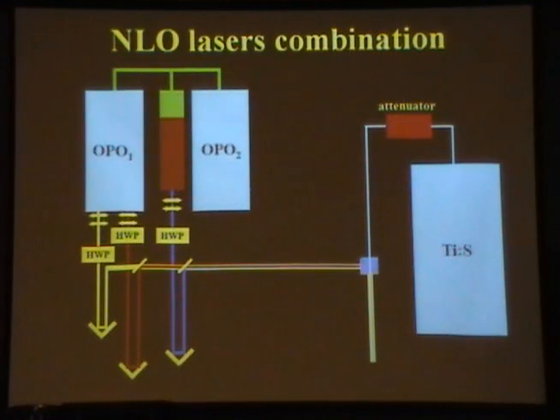Now, what about if you wanted to use CARS and multiphoton microscopy at the same time? So now, I do have the system of 2 OPOs. I just put one of them. The idea here is the following. First, to use CARS, you have to put all the pulses in time, so you have to synchronize them. So you make a delay line for each one of them. You can combine with the fundamental of the pump laser.